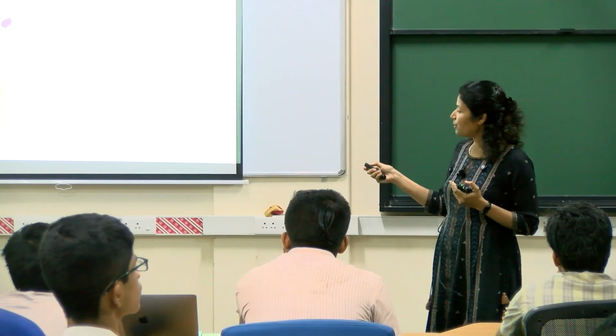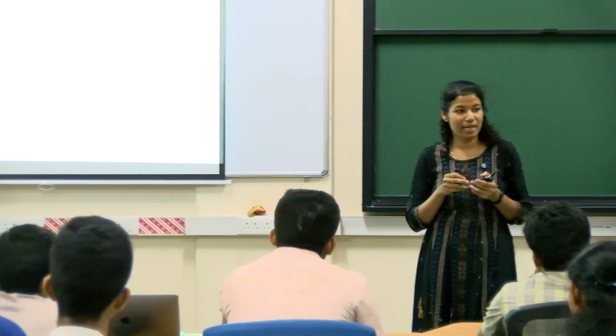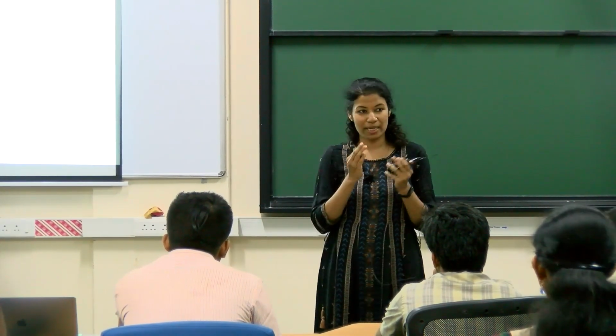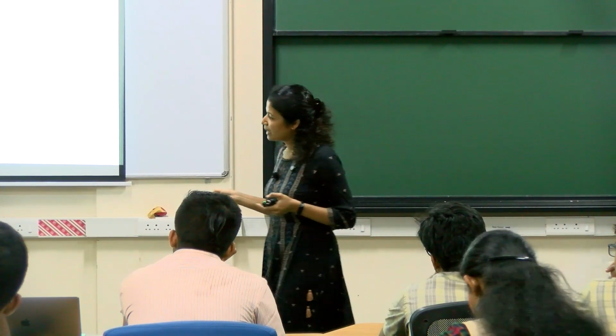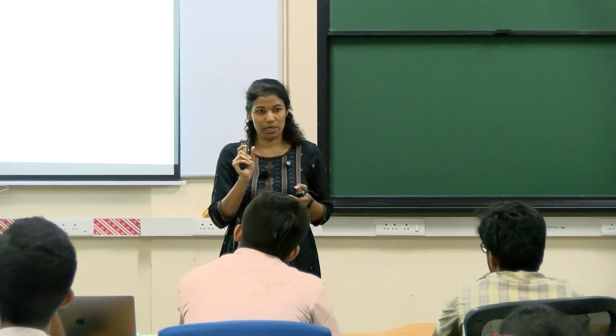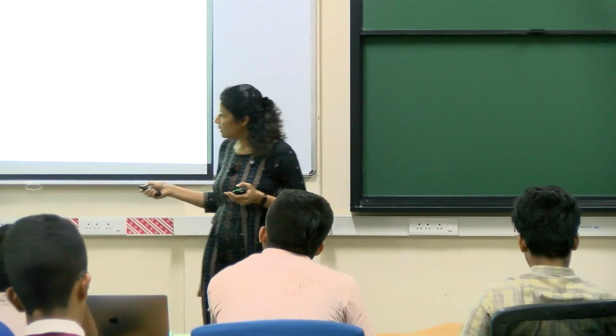See, I can show you different images. I can show you this image and this image. They both are at the same size. But the magnification that you're seeing or the details that you're seeing are at a different size within the image, right? So we always give a scale bar. So in this case, the scale bar is about 10 micrometers. Okay, so that gives you an indication that this much distance is 10 microns.